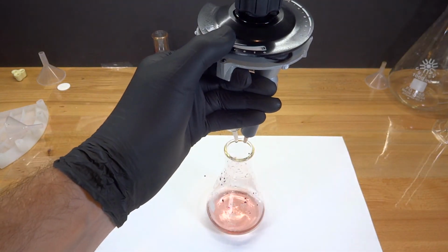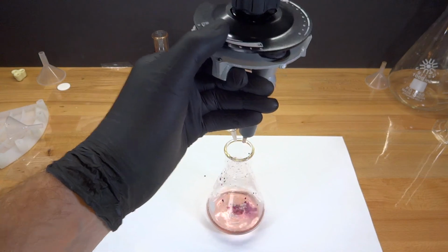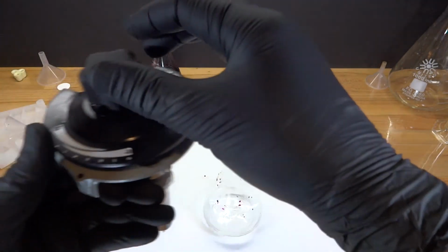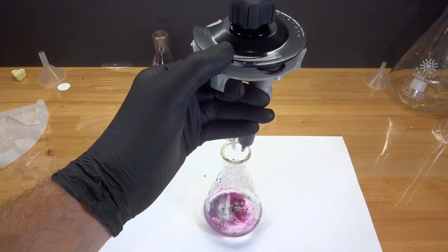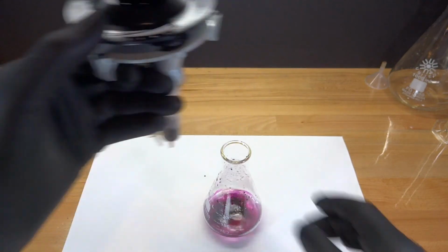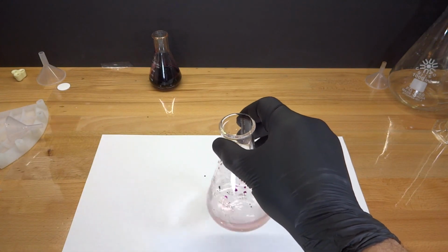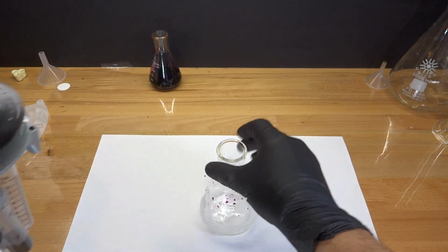Wanting to produce an even paler pink and not taking into account the rate of progress, the experimenter dispensed a bit too much hydrogen peroxide. However, a quick recovery was made with a controlled addition of an analyte heavy mix after a further ratio adjustment. By the way, performing this experiment forwards or backwards yields analogous results.